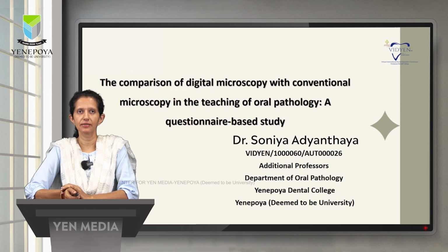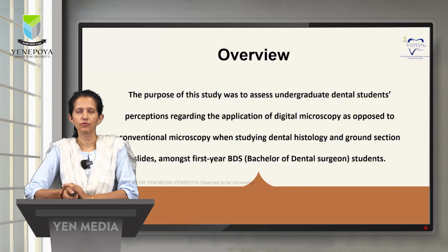The title of my study is The Comparison of Digital Microscopy with Conventional Microscopy in the Teaching of Oral Pathology, a questionnaire based study, and my abstract title is 00026. The purpose of this study was to assess the undergraduate dental students' perception regarding the application of digital microscopy as opposed to conventional microscopy when studying the dental histology and ground section slides among first year BDS students.